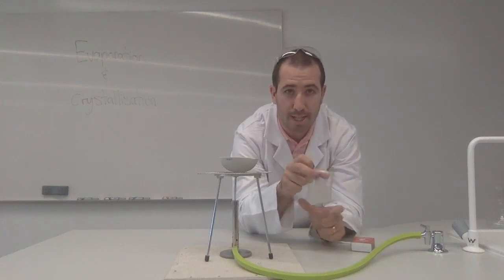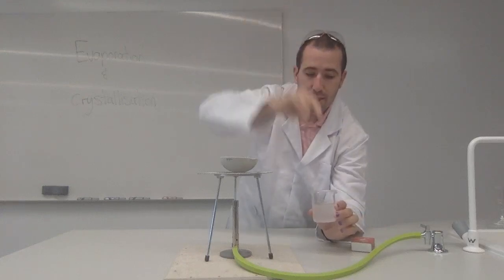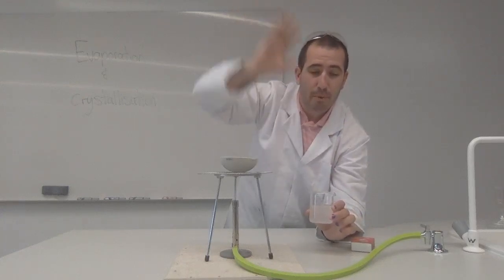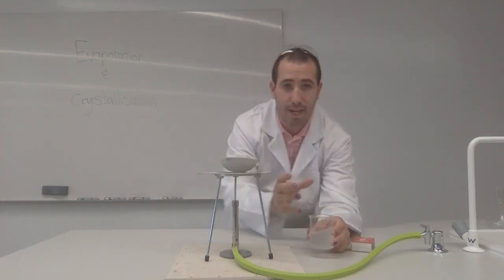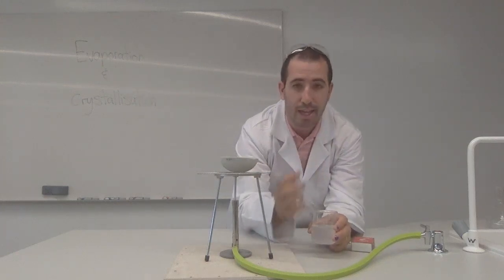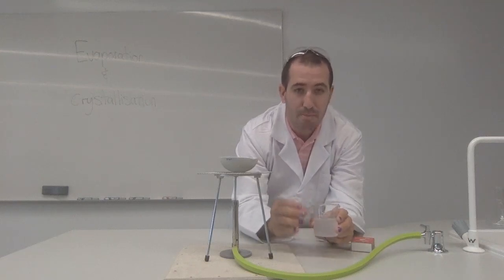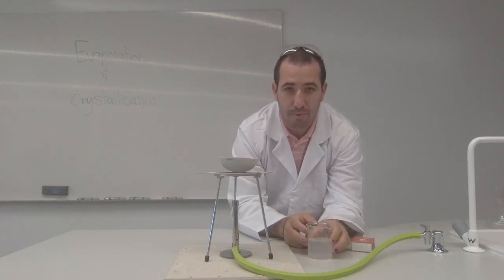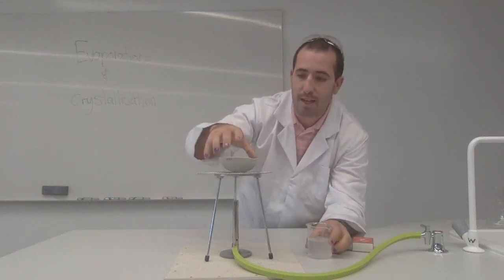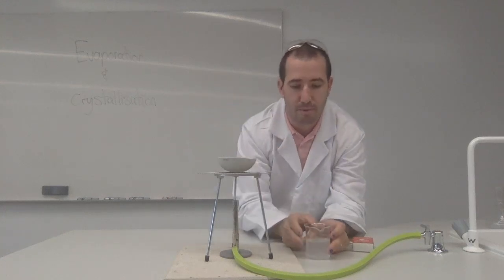So what this process does is that we can evaporate out the solvent, in this case the water, and whatever dissolved is going to crystallize back to its solid particles, and that will be our solute. So this is how we can get our solute back out of the solution. What we're going to do here is use the heating process. We've got our Bunsen burner and our evaporating basin on top of our gauze mat and tripod.